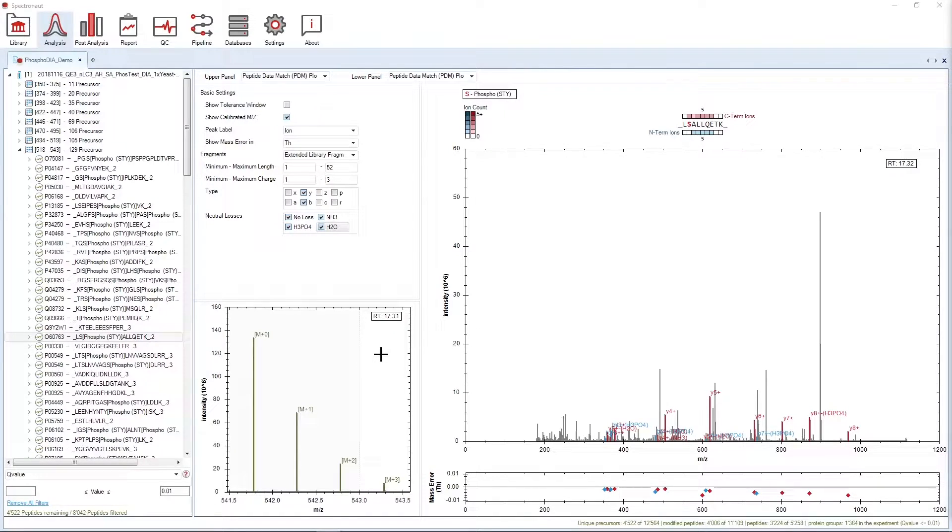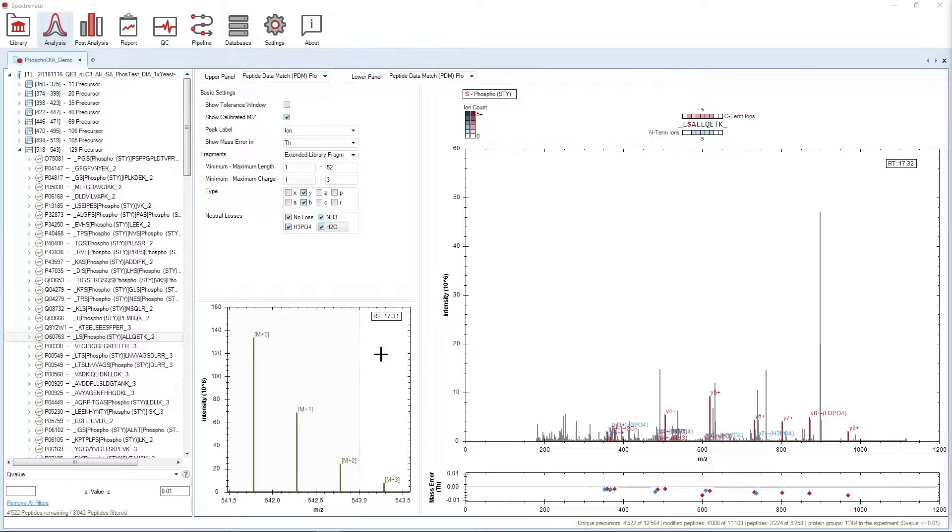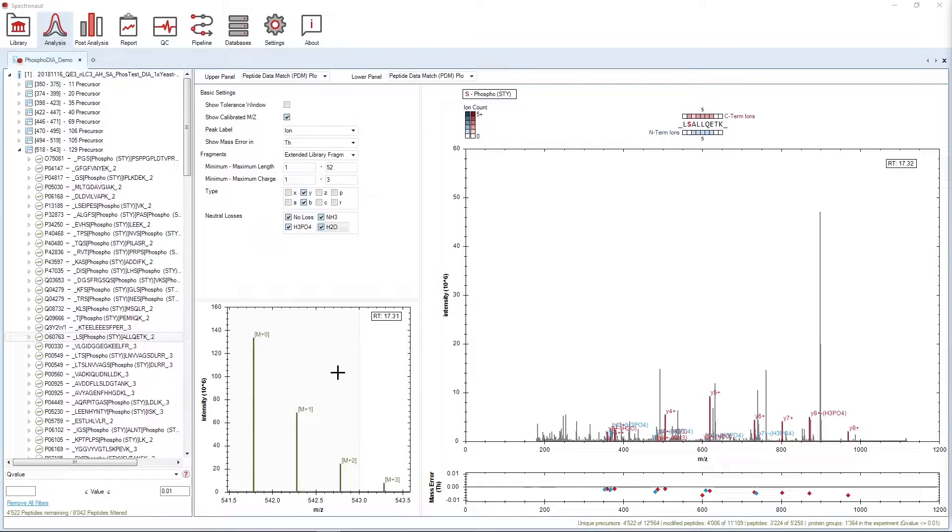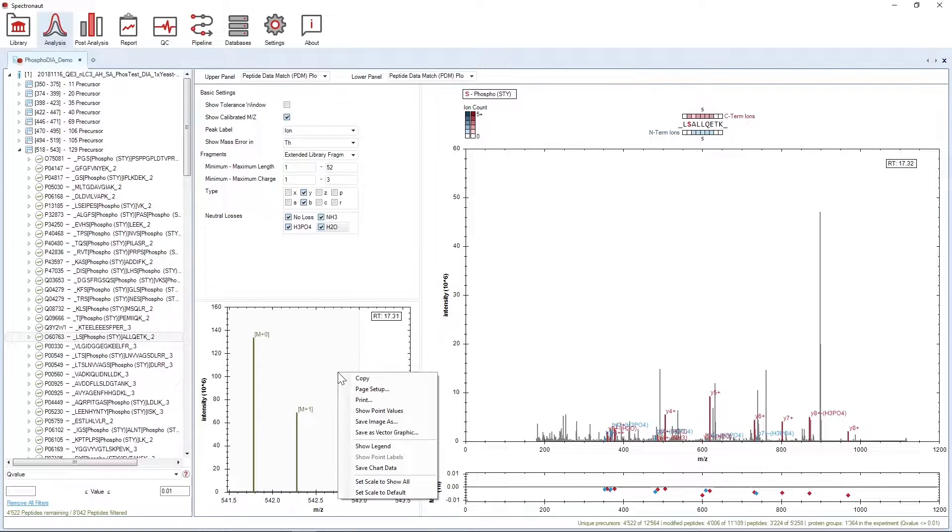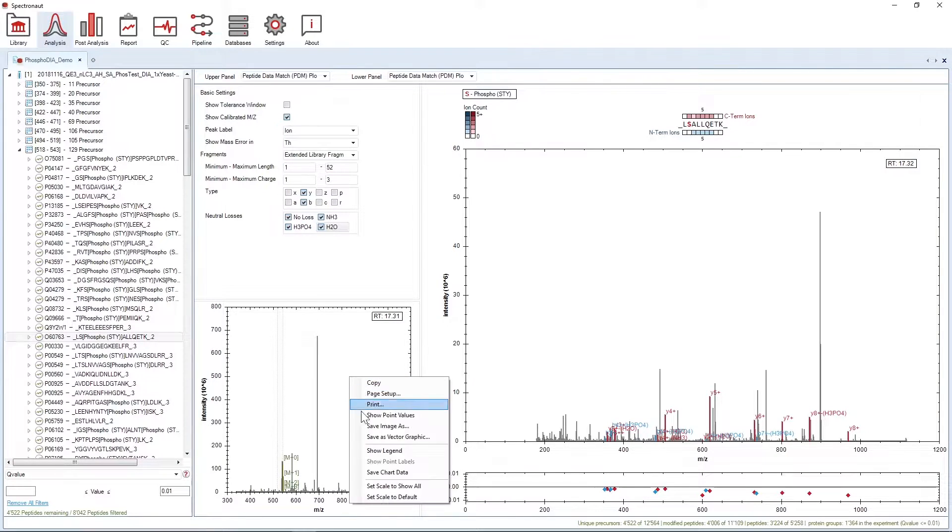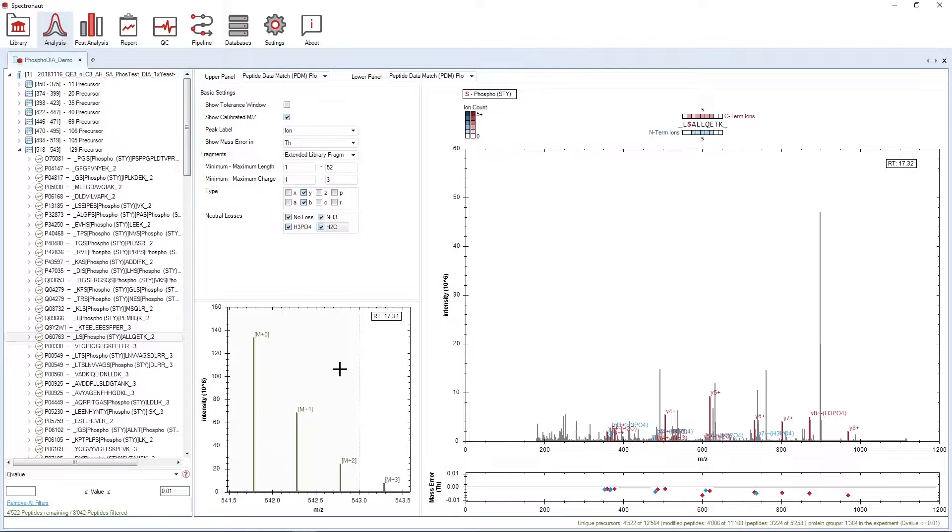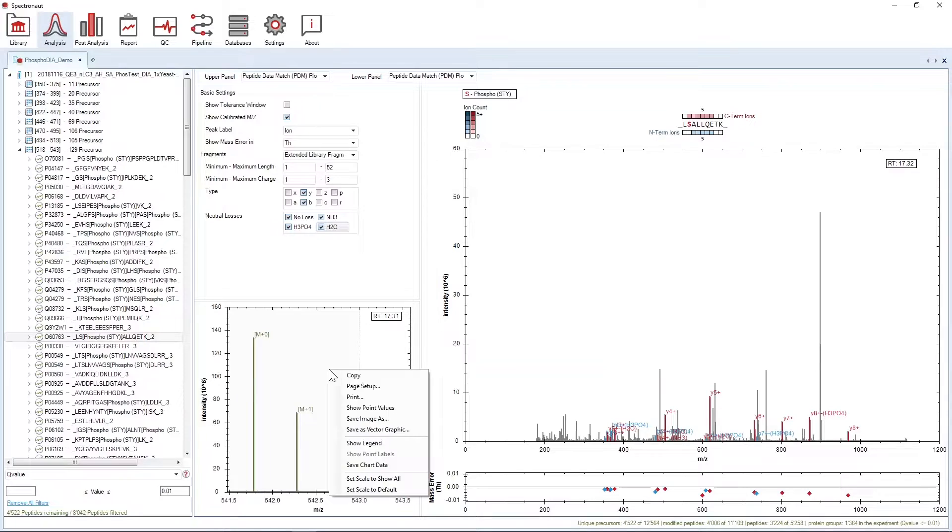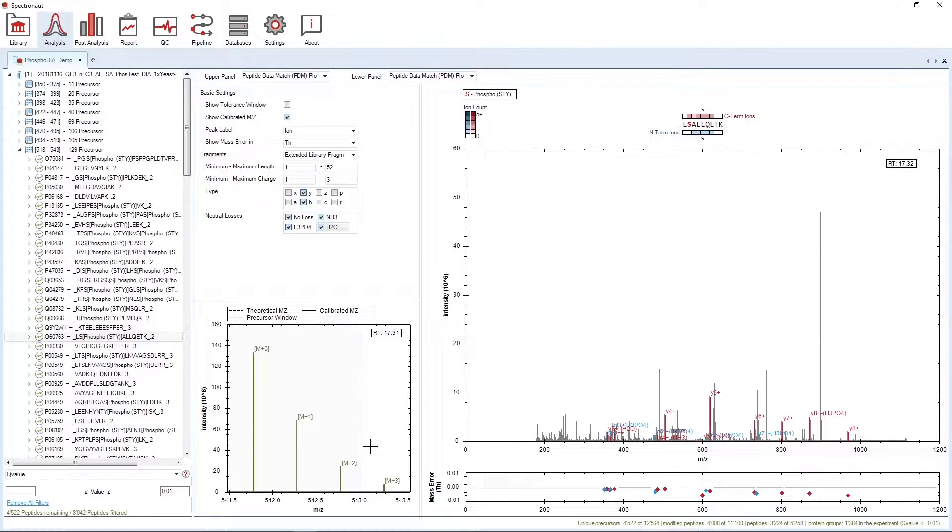The MS1 panel on the lower left contains the MS1 scan with the selected MS1 feature. The scan that is shown is the scan at apex. By default, the scan is zoomed in at the feature, but the whole scan can be visualized by right-clicking on the plot and selecting Set Scale to Show All. It's easy to go back to the feature by clicking Set Scale to Default. If you need help understanding what all the lines mean, you can simply click on Show Legend.